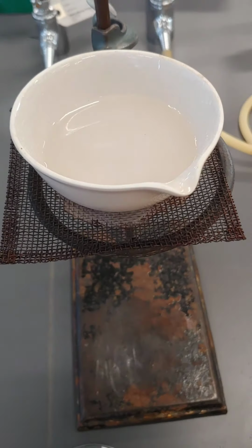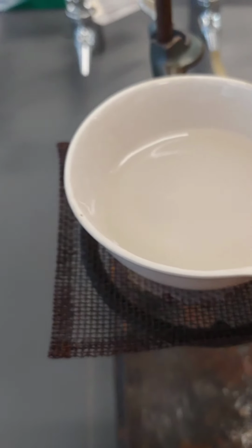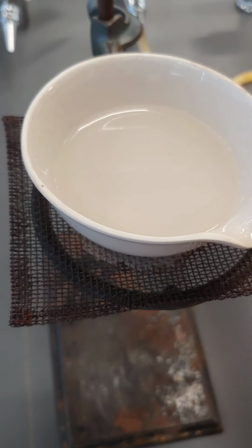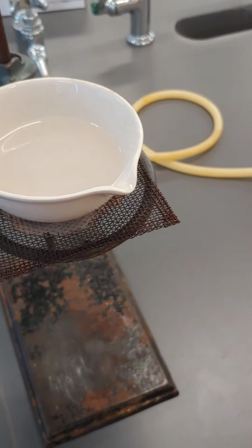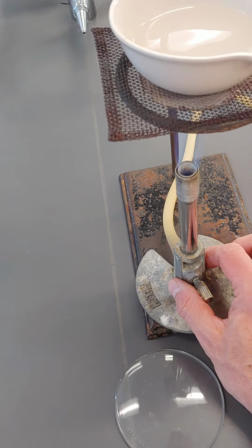Here is the dish that has the salt water that's been poured off of the sand. And so this now I'm going to evaporate, and I have a watch glass that I'm going to place on the top of that so that I don't get any splattering occurring in that process. So I'm going to turn on the gas and begin to heat this up so that I can start evaporating off all the water.